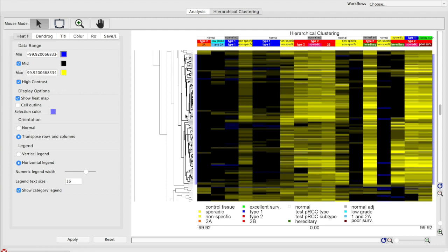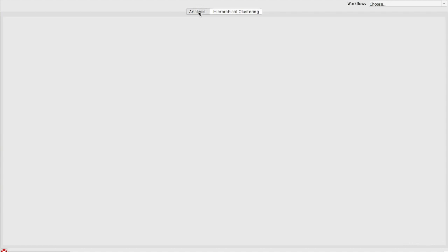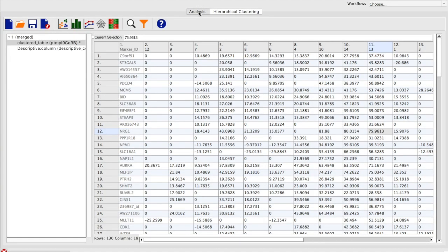So in order to analyze this, what we're going to have to do is get some fold change information for these 130 genes. And to do that, we're going to go back to our Analysis tab. Given down below are the 130 genes that we isolated in our cluster, along with the normalized fold change for each one of the 17 different comparisons in our meta-analysis.